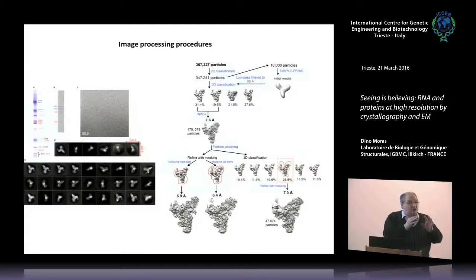It's when you reconstruct that you know if they are all the same, just viewed from the same angle, or a different object. That is something which is different. So it looks to the human eye like these are not just different projections, but that the pieces can move. That's another point. We'll come to that. And so, is it having the crystallography on the parts that enables you to tell them? Of course, we'll come to that.